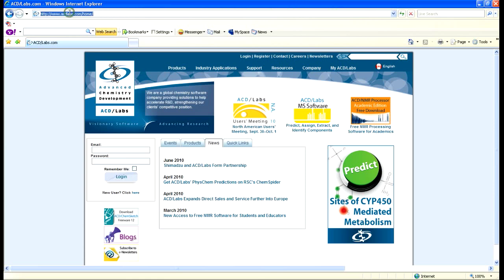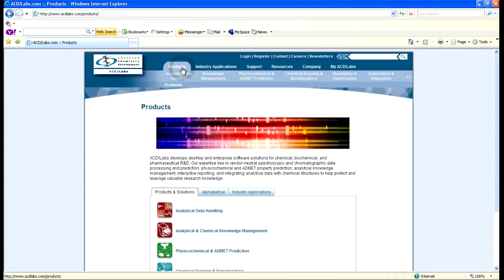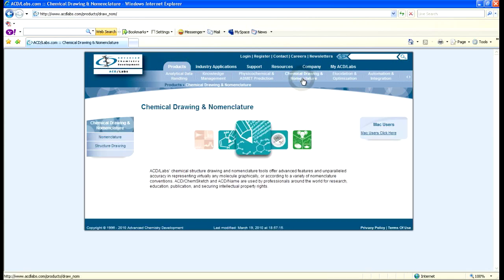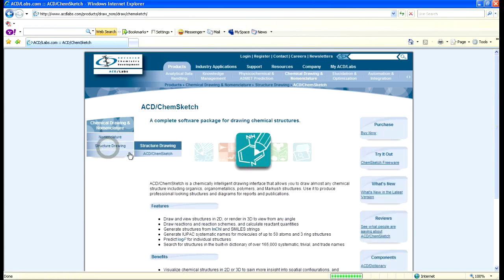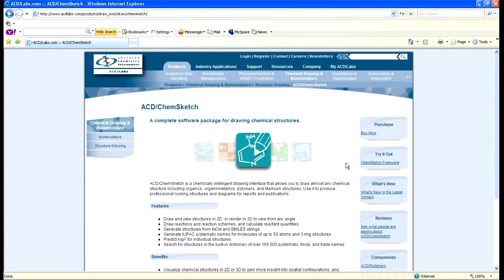Navigate to acdlabs.com. From there, click on Products, then click on Chemical Drawing and Nomenclature. Over here to the left, click on Structure Drawing. And finally, over here on the right, click on ChemSketch Freeware.